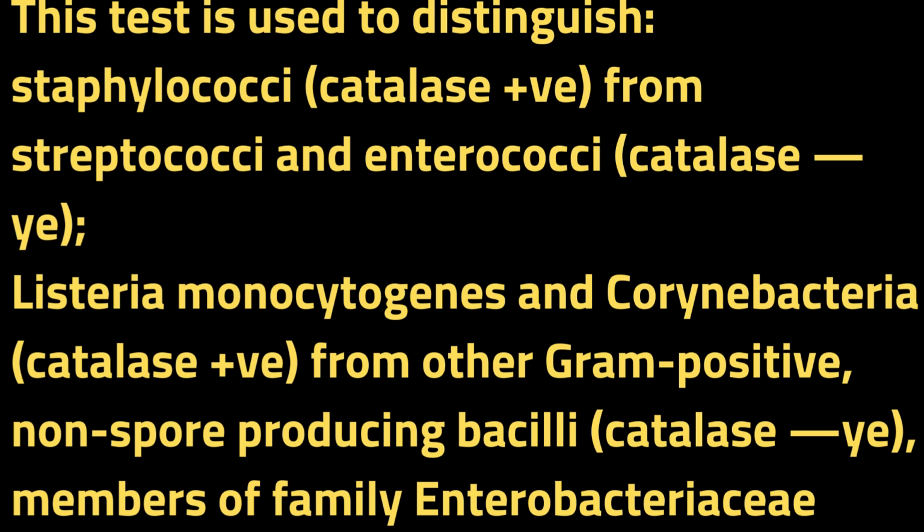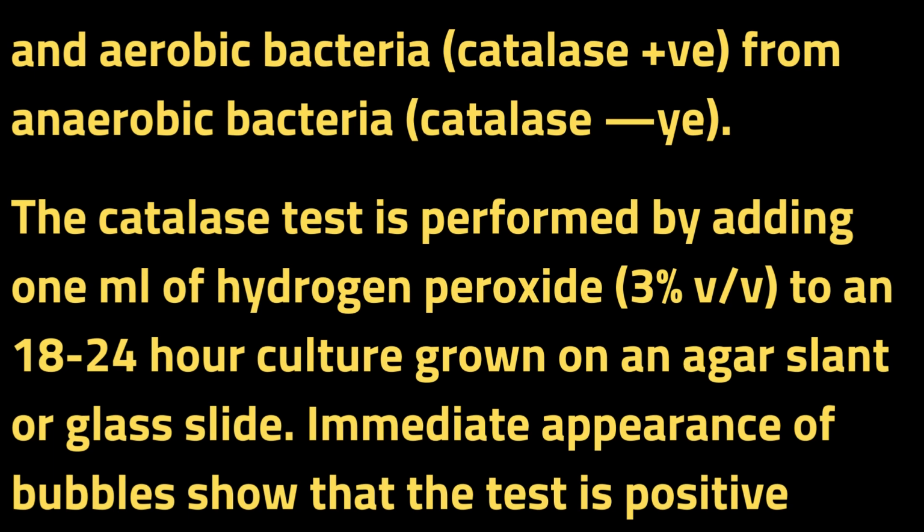Listeria monocytogenes and corynebacteria, catalase positive, from other gram-positive, non-spore-producing bacilli, catalase negative, members of family Enterobacteriaceae. And aerobic bacteria, catalase positive, from anaerobic bacteria, catalase negative.